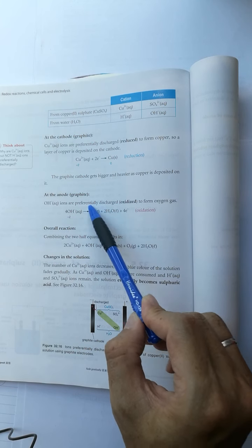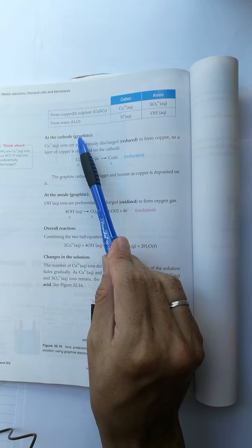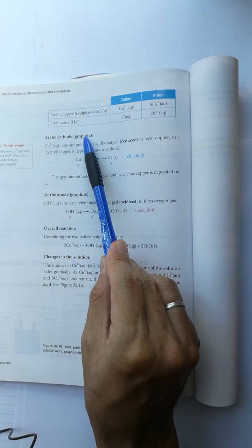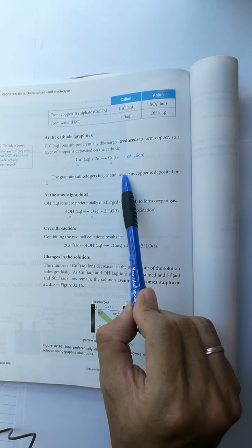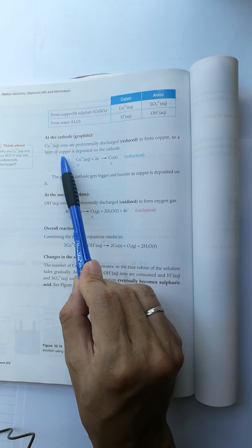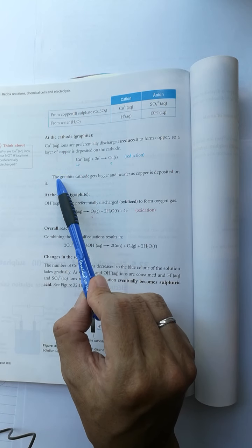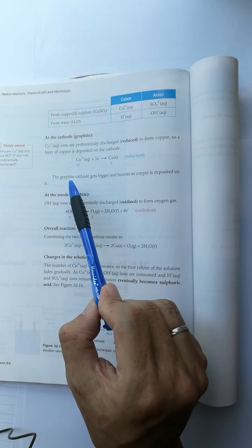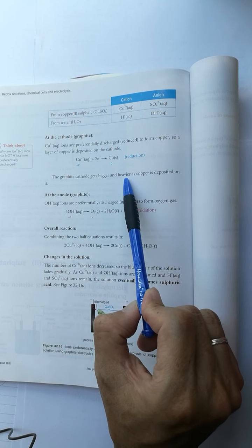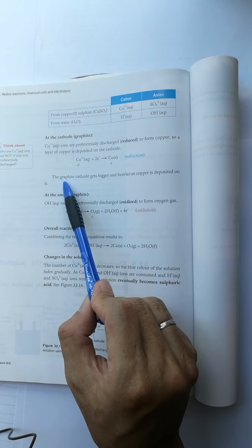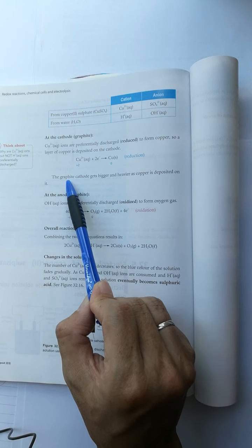The black graphite cathode changed to reddish brown copper. The color changes from black to brown, and the graphite becomes heavier as the size increases.